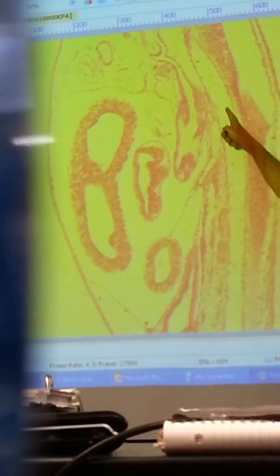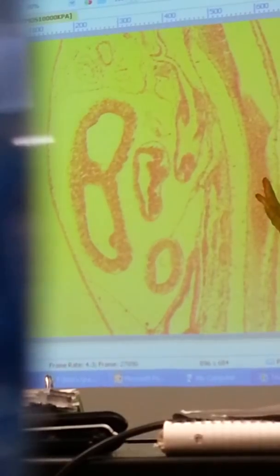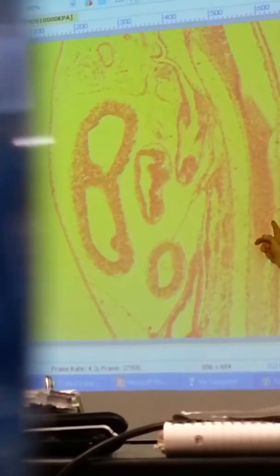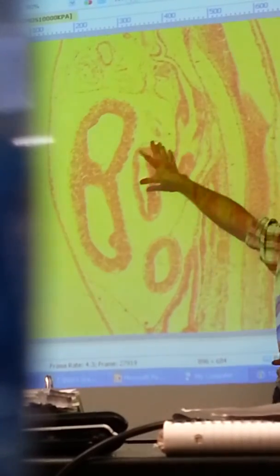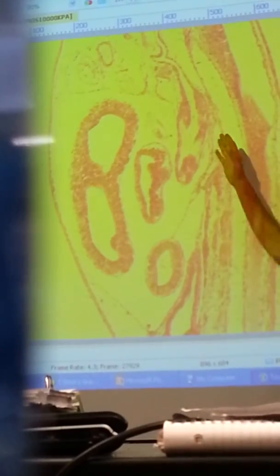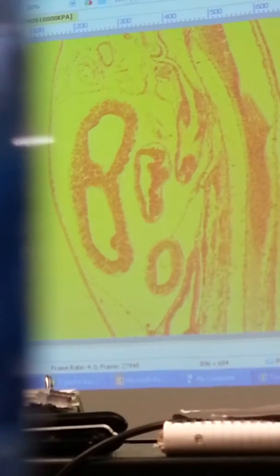That's all that's left. Can you point to the notochord on your slide? Sure, it's this clear zone that runs right down his back. Above the notochord, remember, must be the spinal cord. Below the notochord will be all the guts of the animal, and the notochord itself you could think of as a sort of primitive vertebral column.